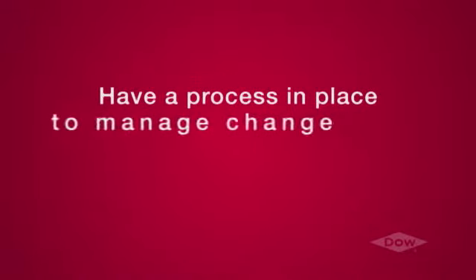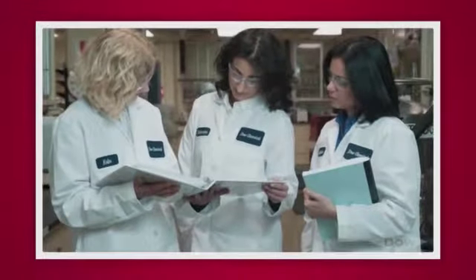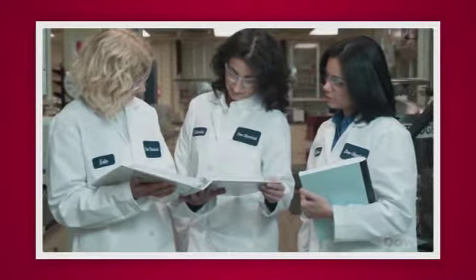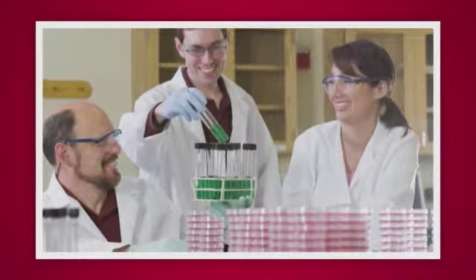Having a process in place to evaluate and manage change is extremely helpful, and inviting others to get involved as you work through the process is smart. Your supervisors, advisors, co-workers, and environmental health and safety, or EH&S experts, can put their knowledge and experience to work for you. They can help you identify potential hazards and offer ways to mitigate those hazards.